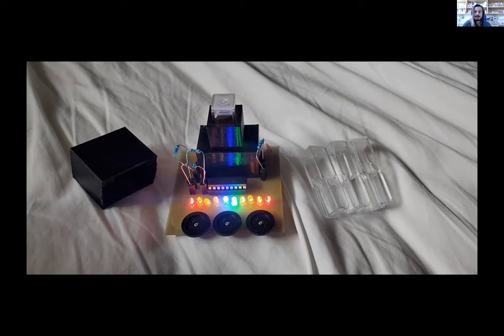So, and it runs off of a USB. If you get a USB cable off Alibaba, the chips are like $5 for like 100 or something like that, last I checked. LEDs are pennies, resistors are also pennies. The only ones that are slightly more expensive are the little knobs, but I'm looking for different ways to remove that entirely. But essentially, this is the cheapest possible optical density unit imaginable, right?